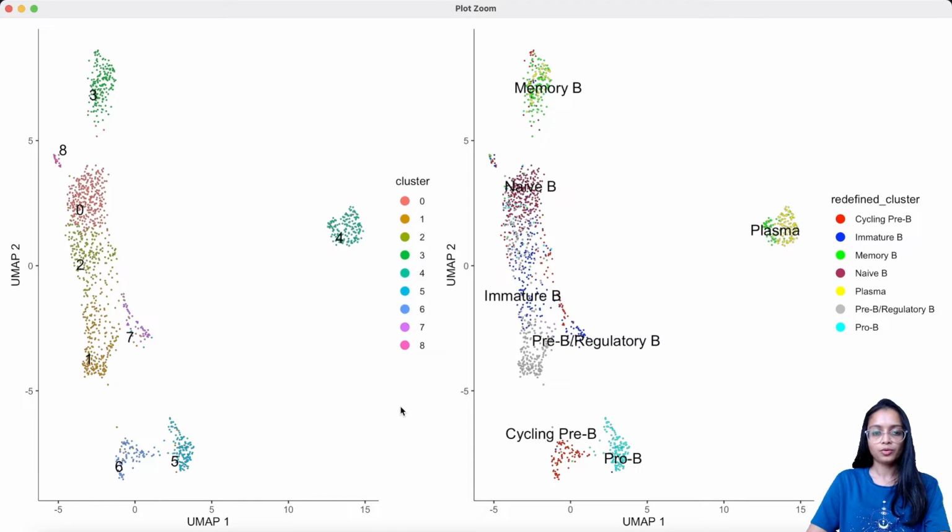These plots show that the clustering information that we transferred from the Seurat was used to build these clustering plots, and we retain the clustering. In Seurat as well, we identified 9 clusters, and these are the exact same 9 clusters with the exact same topology. So we would want to go ahead with this and generate a trajectory for these cells.